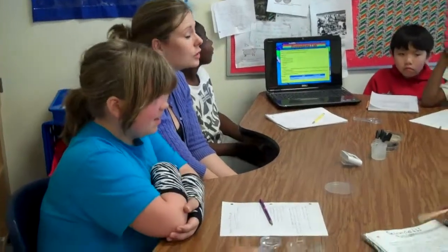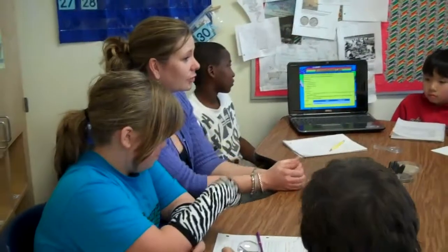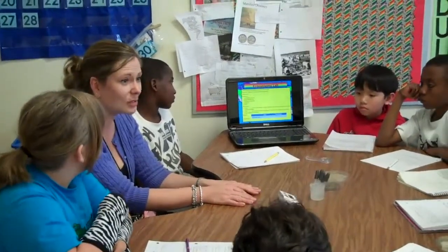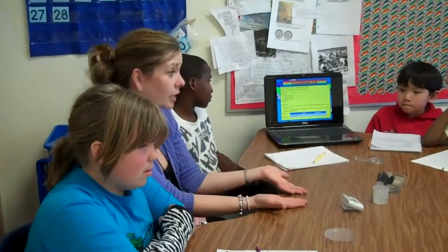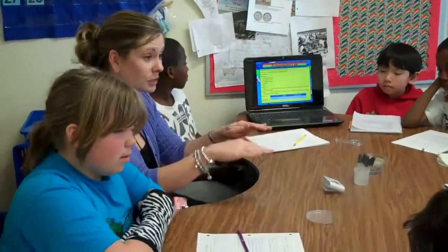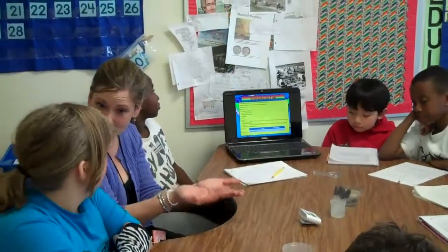Yeah. And now let me also give you this little bit of advice too. If I found sand right from the beach, there probably would be more bacteria in it, but this sand came from a sample bag of clean sand. So it would probably be an even better experiment if we were able to get some beach sand and test it. But the potting soil also came from a bag of potting soil. So that keeps it more controlled.